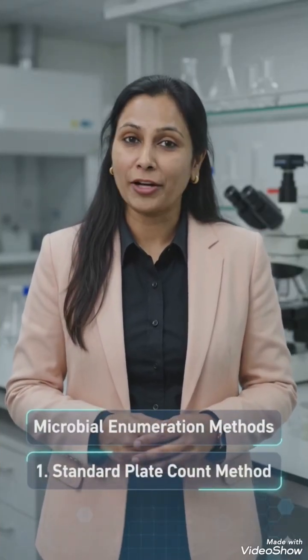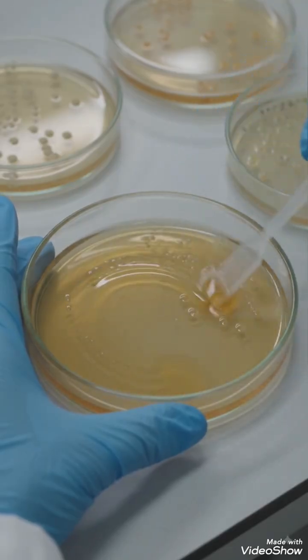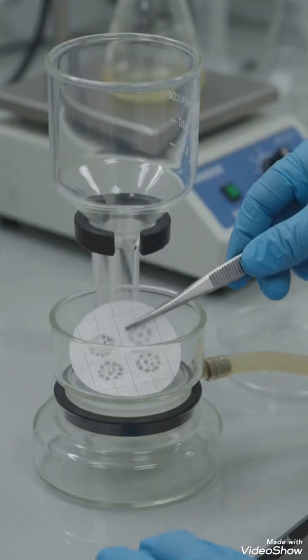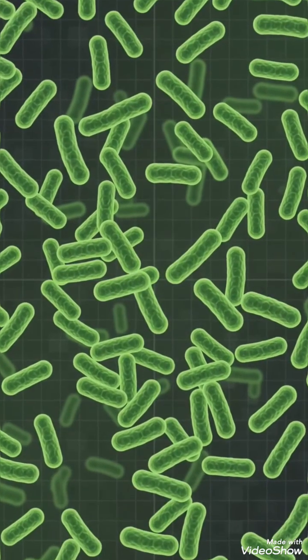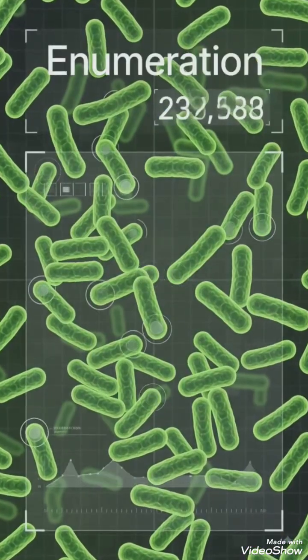In this video, we will learn three important methods of microbial enumeration: plate count method, membrane filtration method, most probable number method. Enumeration means estimating the number, counting of microorganisms present in a sample. Enumeration generally measures viable microorganisms capable of growth. Depending on the method used, microorganisms may be counted as colony-forming units (CFUs), most probable number (MPN), cells per milliliter.